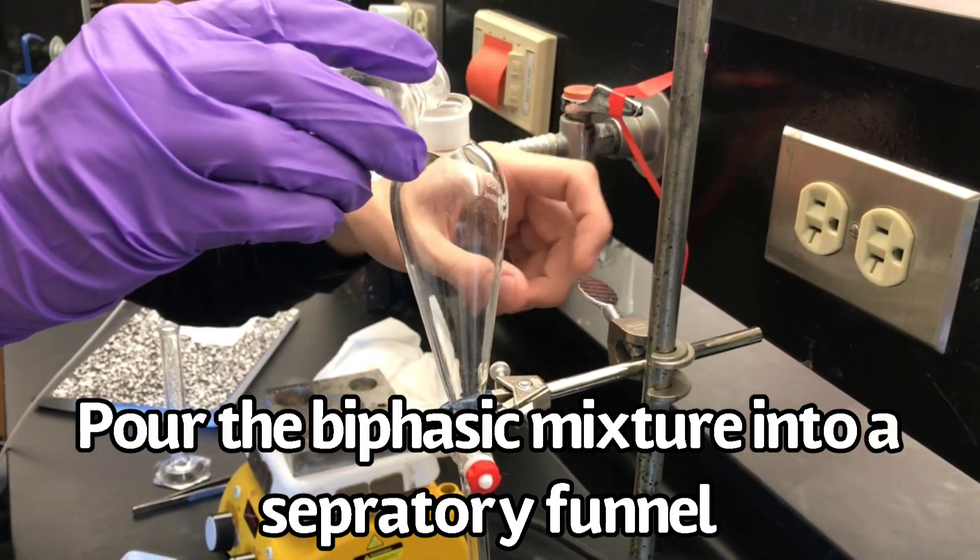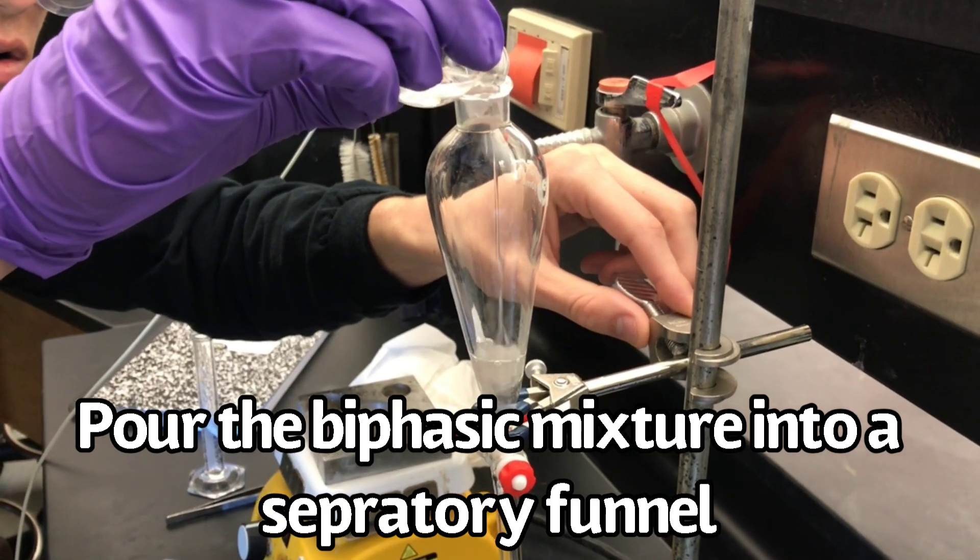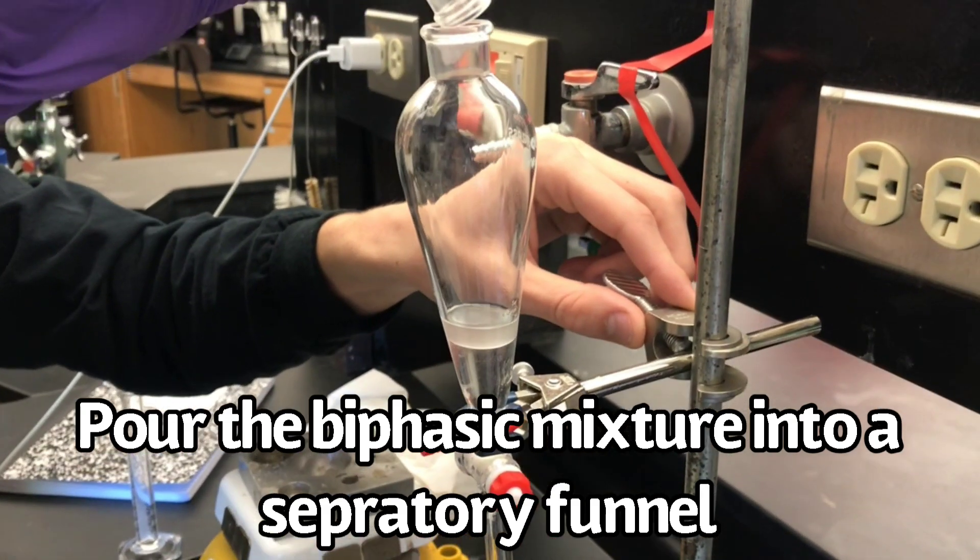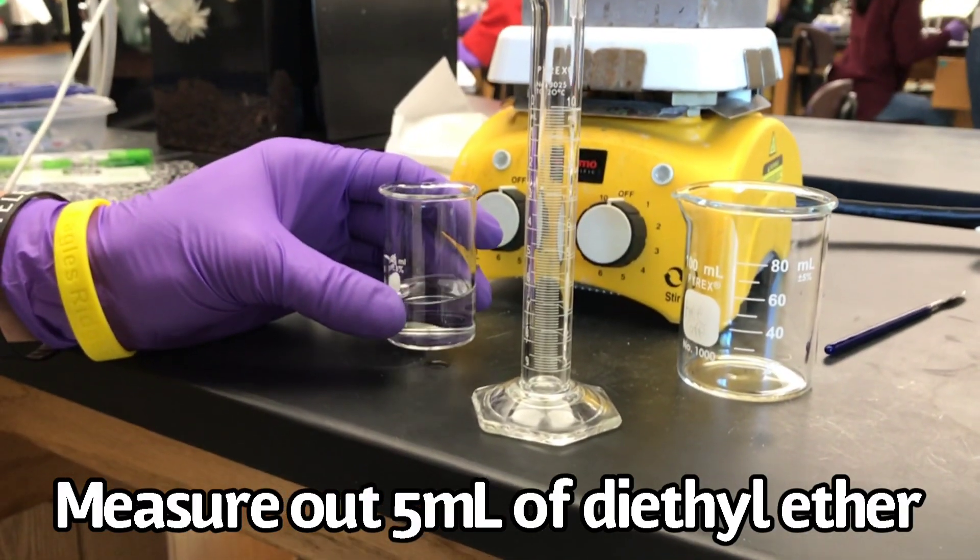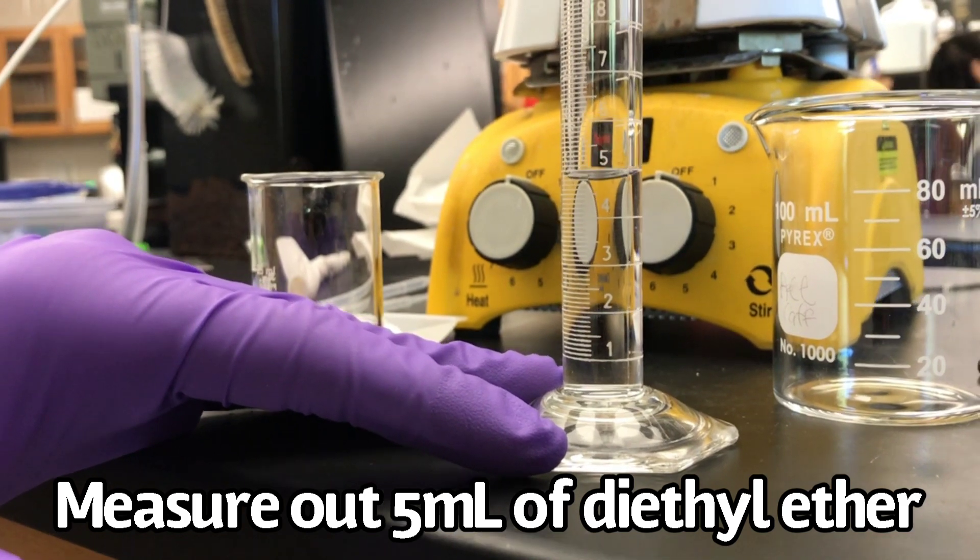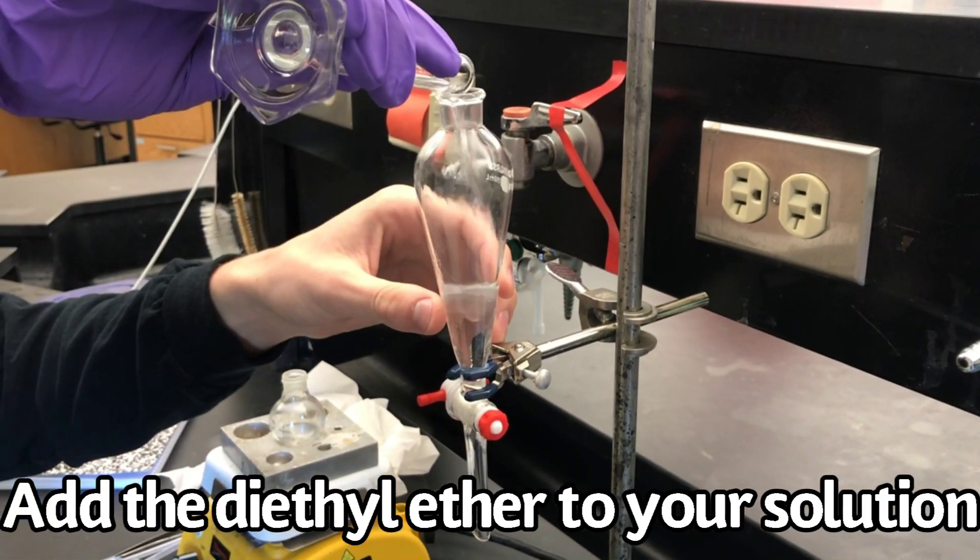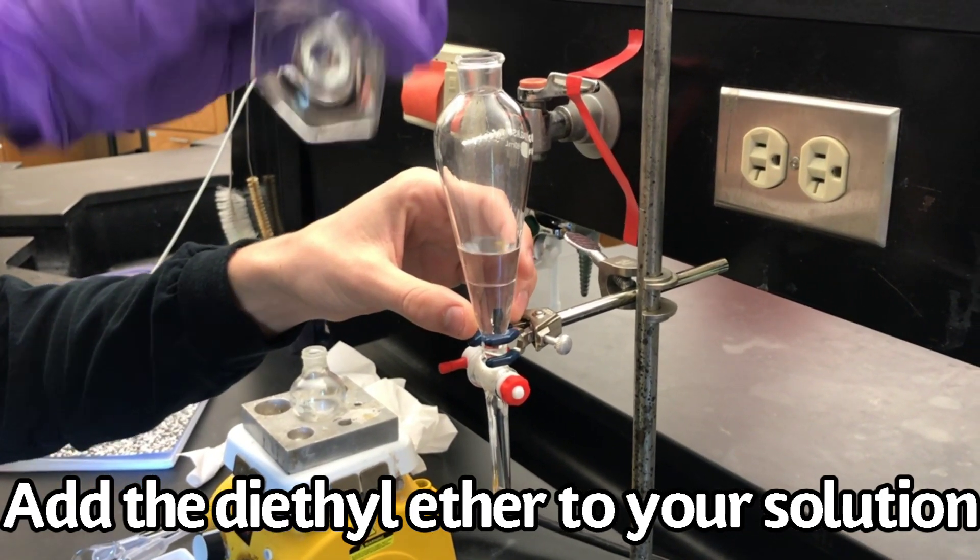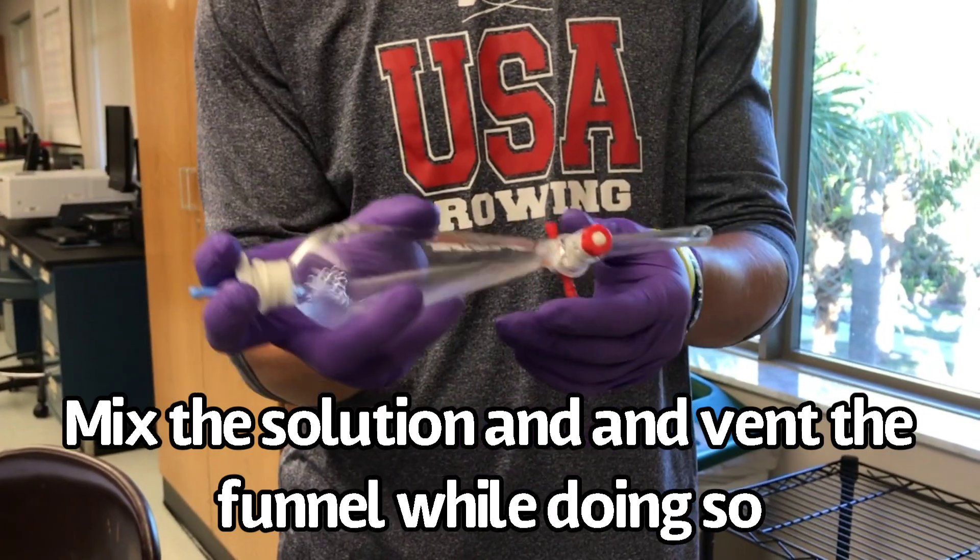Next, pour the biphasic mixture into a separatory funnel. Measure out 5 milliliters of diethyl ether. Add the diethyl ether to your solution. Mix the solution in the separatory funnel and remember to vent the funnel while doing so.